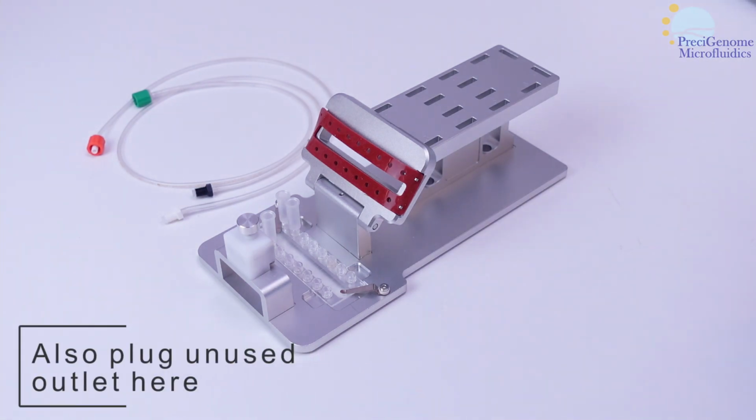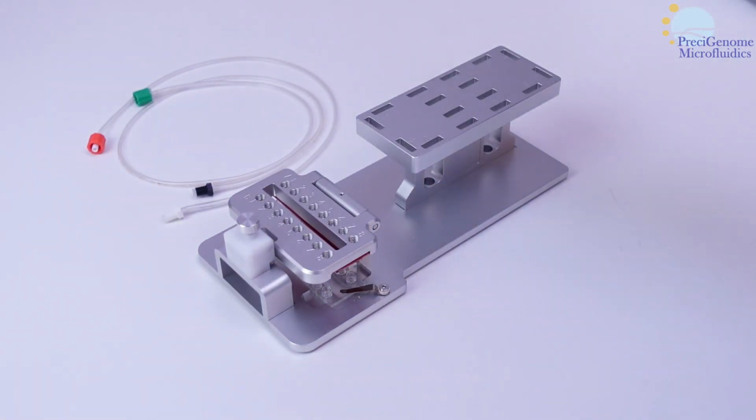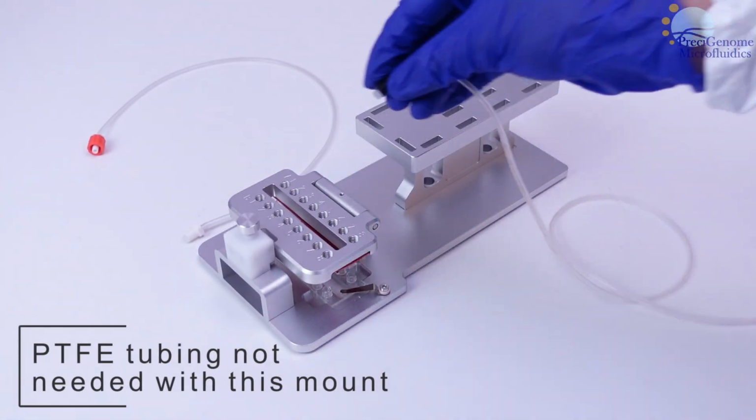Don't forget to plug the unused outlet. Here, we did that in advance. The top ports connect to Tygon tubing with an included adapter. You won't need any PTFE tubing with this setup.